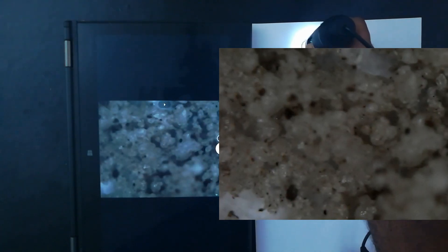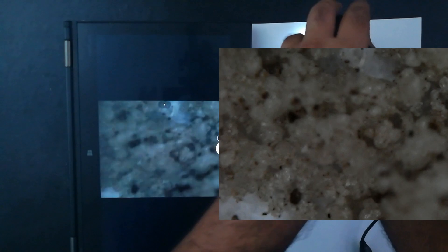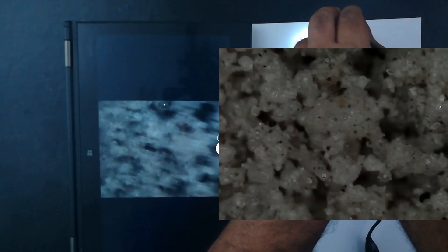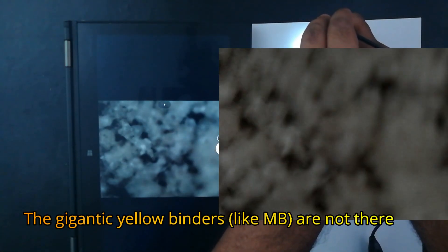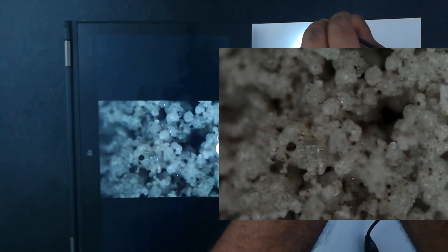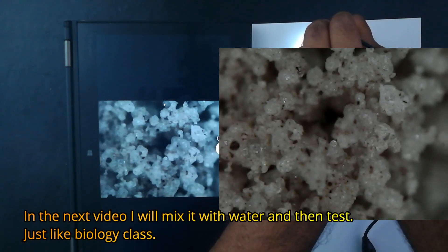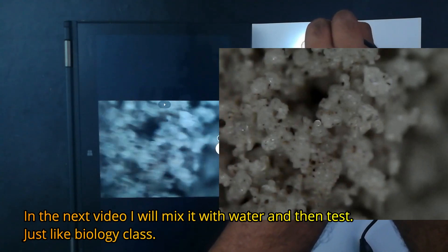Now, if we dirty and quick and dirty move to Nutrimed. Now, here's something interesting. It's got, you can see, right? It's got certain things which are like those Beginner's Whey black dots. I think those are colors because this thing is also flavored stuff. But apart from that, everything is more or less. There are some yellow dots though. There's small yellow dots. But that's very less. The rest of it is just the same structure as the As It Is and some of the structure of Beginner's Whey. I think this is how whey protein looks like.